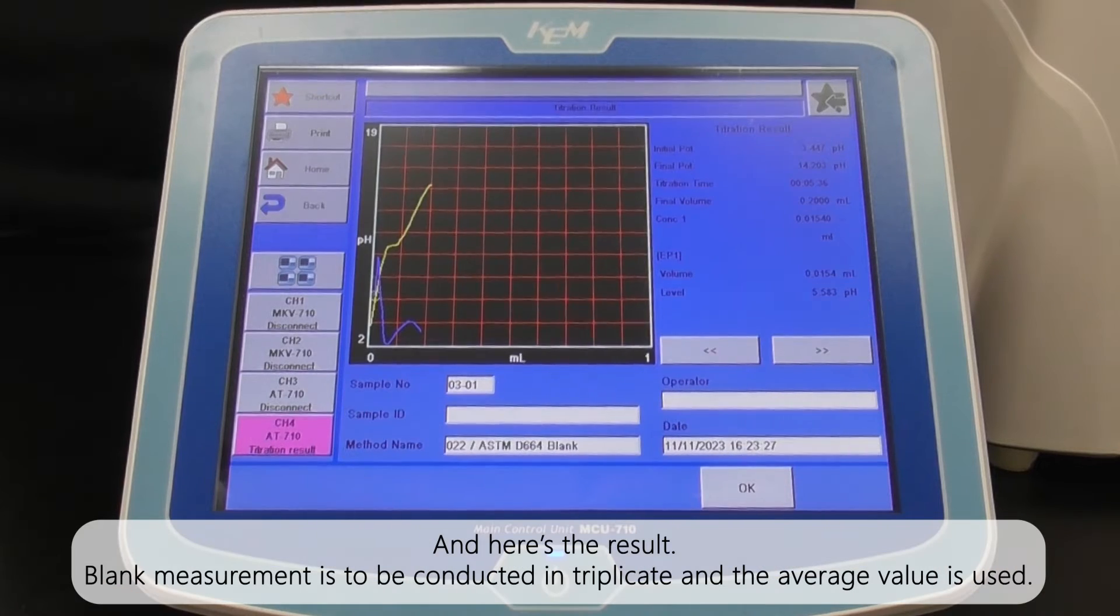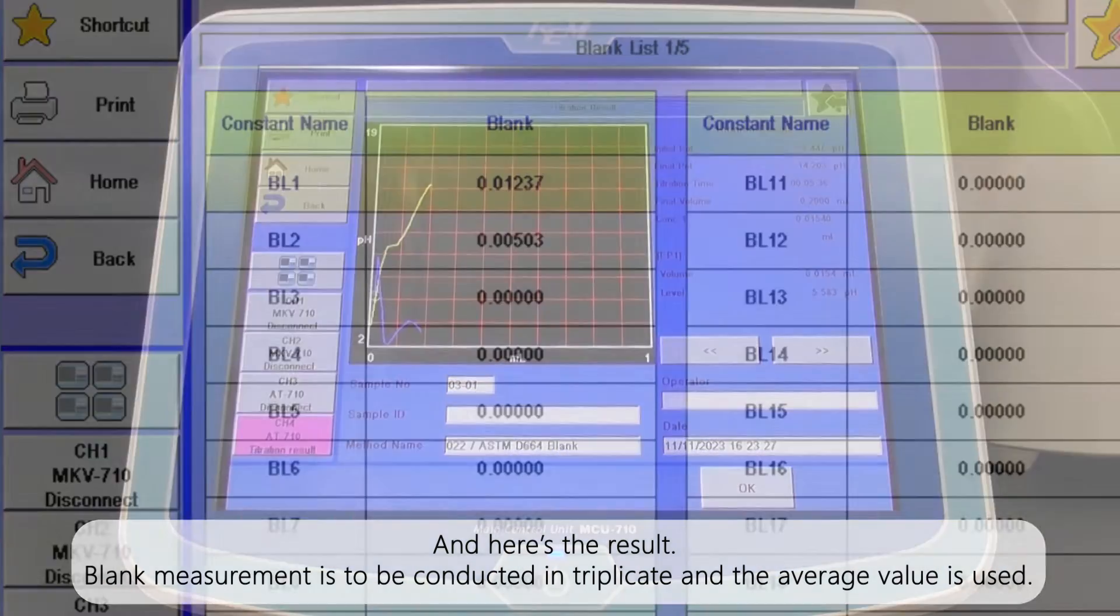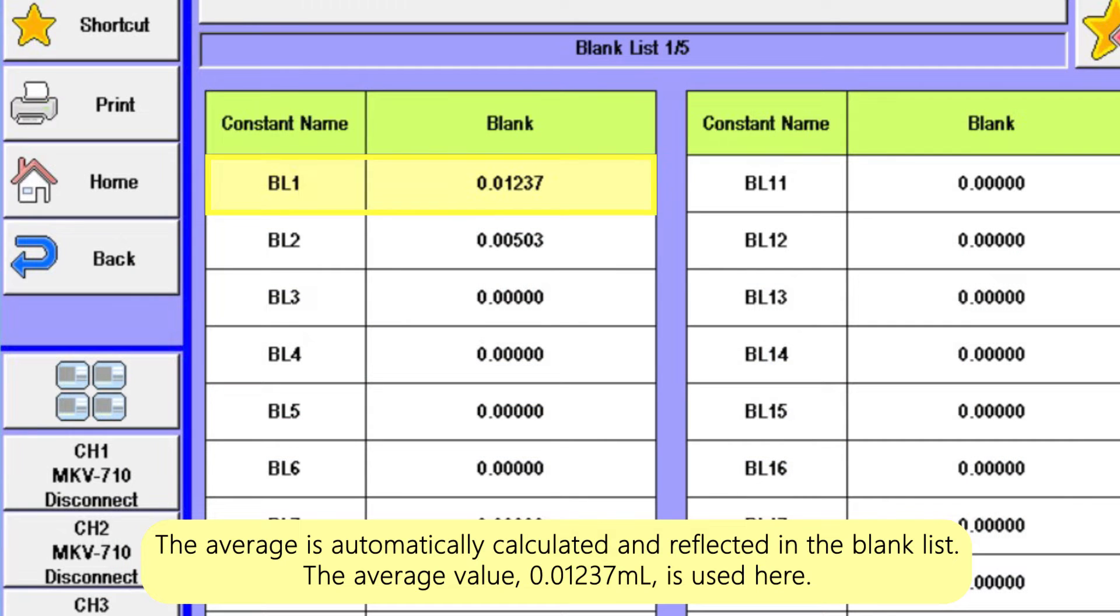And here's the result. Blank measurement is to be conducted in triplicate and the average value is used. The average is automatically calculated and reflected in the blank list. The average value 0.01237 mL is used here.